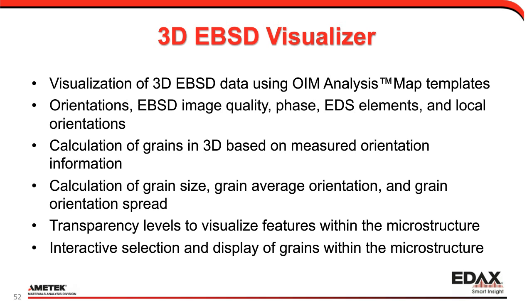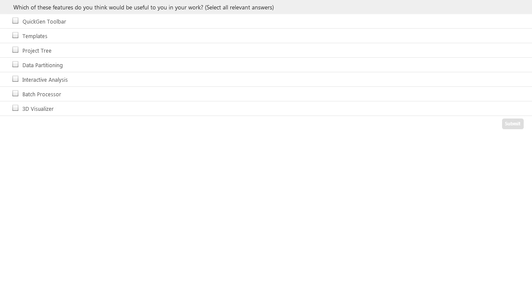So for our next quiz here, this is kind of an overview of what's currently in the software. If any of these think they'd be useful for your work, I'd be interested in knowing. So if you don't mind just kind of clicking across there and then submitting, I'll wait for a few seconds.